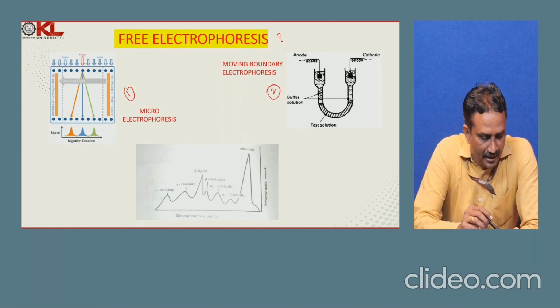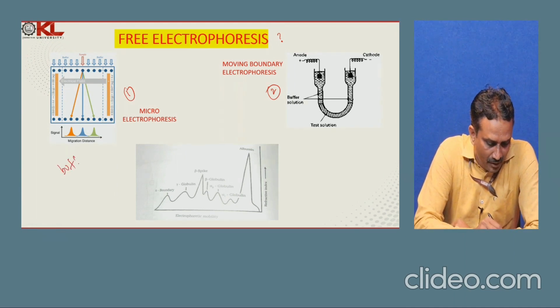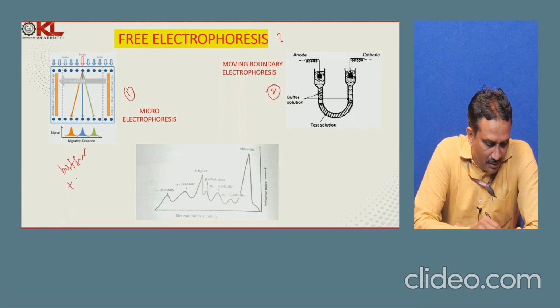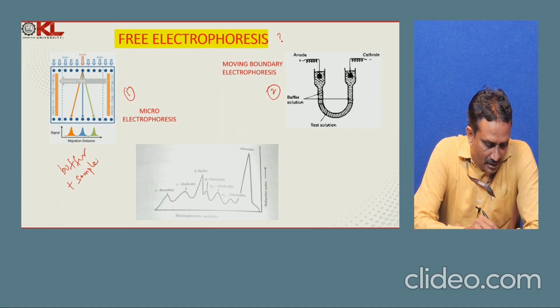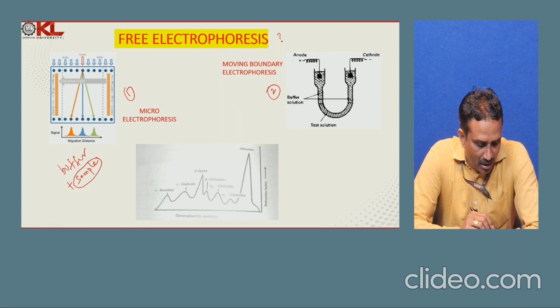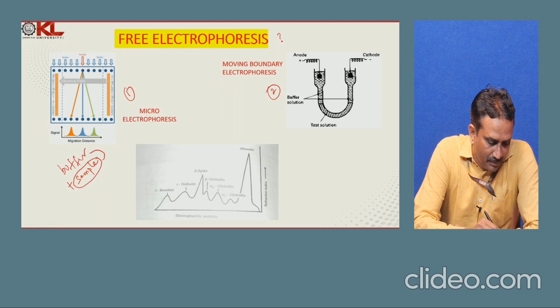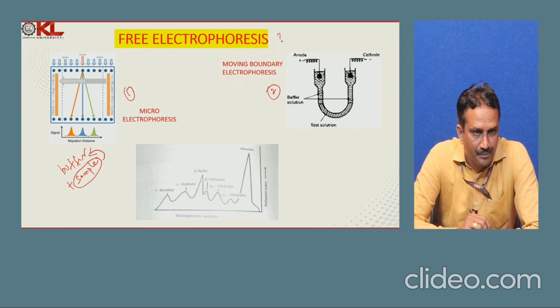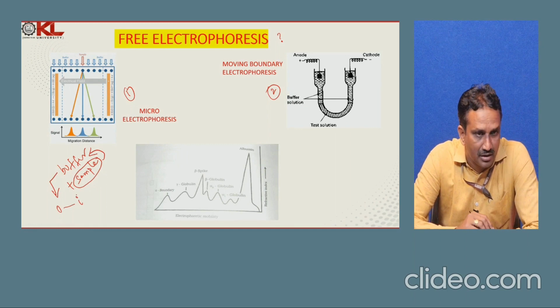How the process is carried out is, a buffer will be chosen and the sample will be applied directly to the buffer, which means the sample will not be loaded at a particular point, or even if it is, it can mix up or solubilize with the buffer. Along with the buffer, the molecules move from one direction to the other.